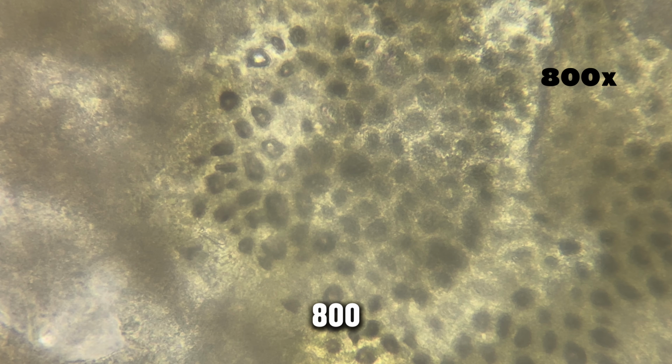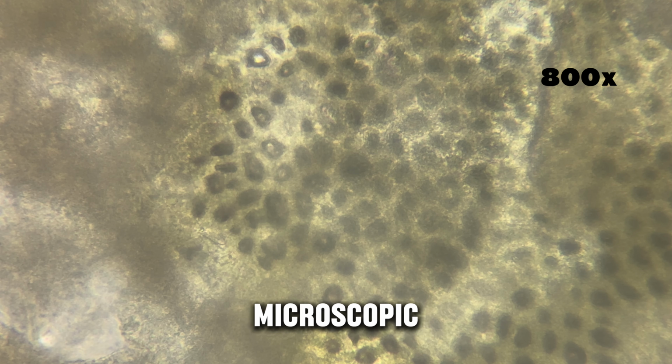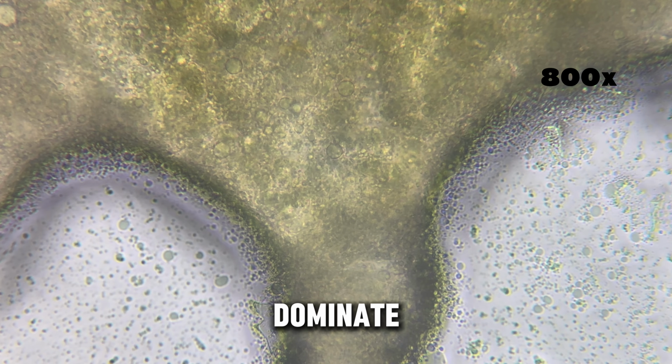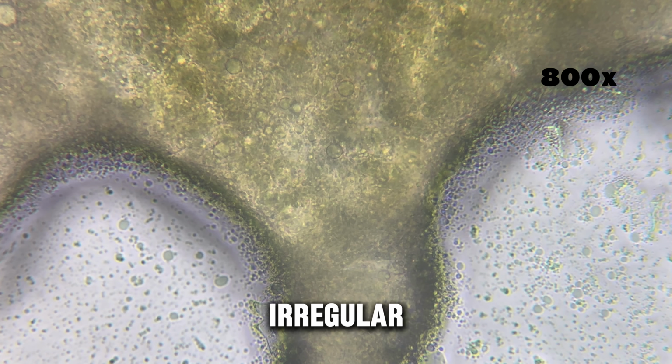At 800 times magnification, mustard transforms into a detailed microscopic landscape. The field of view fills with tightly packed structures and strong contrasts. The image becomes busy and visually dense. Large clusters dominate the scene. They appear compressed and heavily compacted. The boundaries between these clusters are clearly defined. Their edges form irregular shapes that interlock with one another.